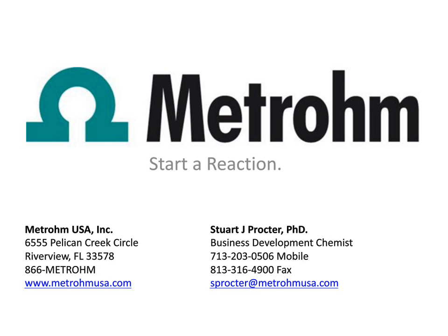And if you think about it this way, if you have a really expensive car, say a Lamborghini, are you going to get in the Lamborghini with muddy shoes? No. You are going to make sure to keep it pristine, and you don't want to mess it up. You're using these very expensive instruments like LC-MS, GC-MS. You don't want to inject junk onto there and get everything all fouled up when you're using something that's very precious. And I know many people have to jump through hoops for capital expenditures at their companies. So it's better to do some sort of cleanup prior to analysis.